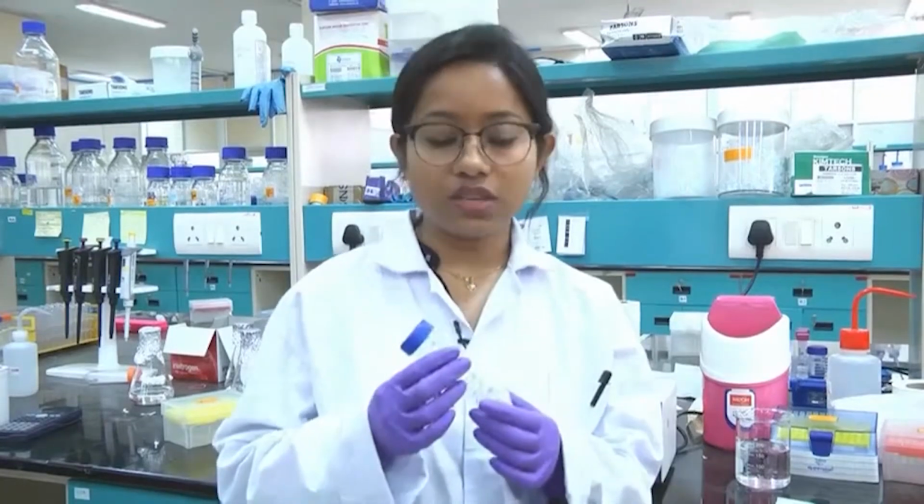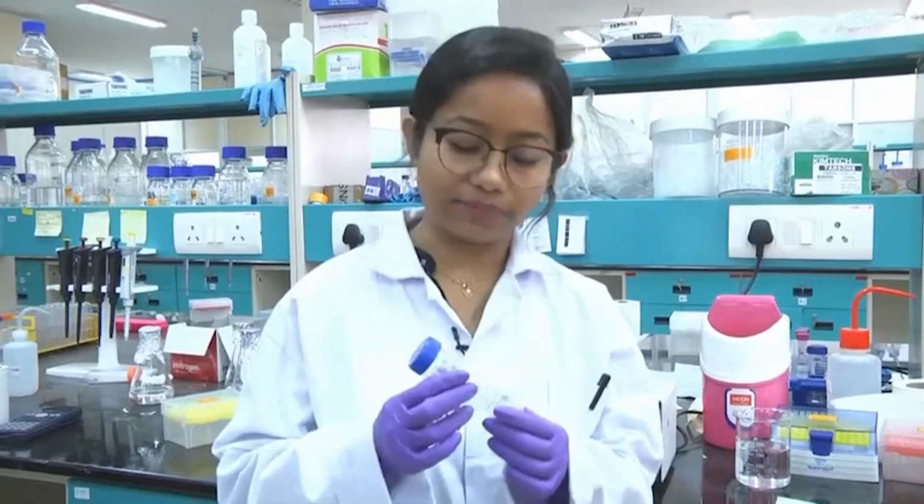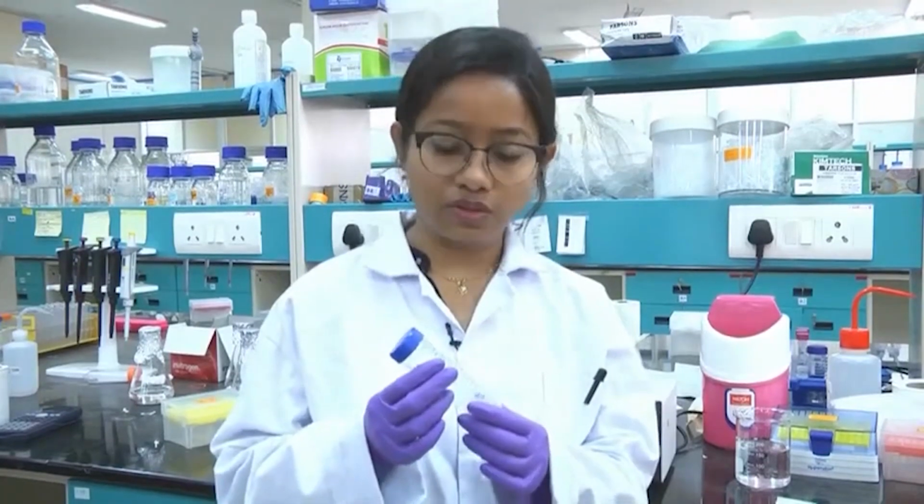But since we will use an FPLC system, or a column purification with a nickel NTA column, we do not use EDTA here, because it hampers the later purification process inside the column. So, as I mentioned, check the literature, and based on your protein choose what kind of buffering system you want to use.